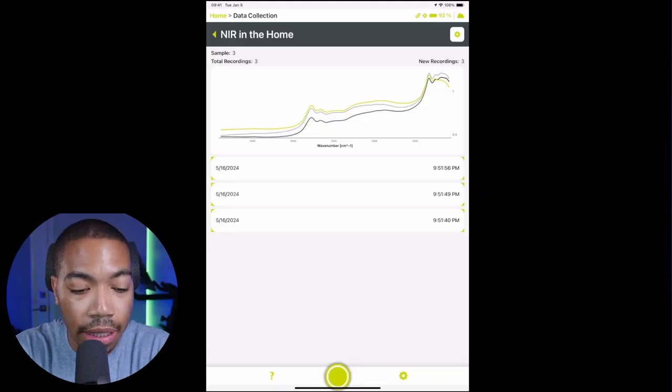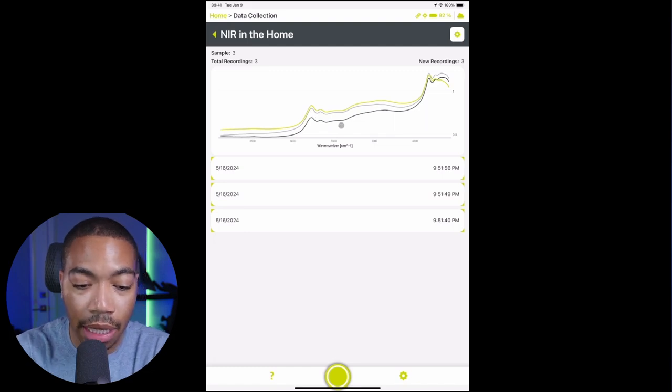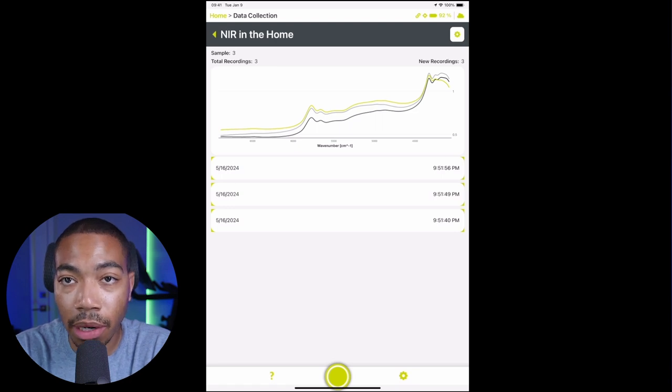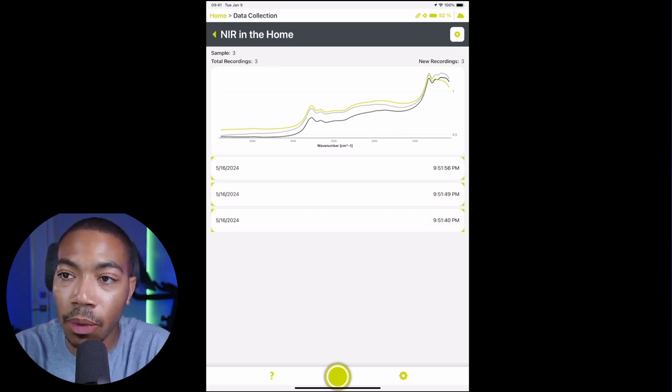So if we look at this data here, we can see that again, it does look very similar to the other HDPEs. We do see a little bit more variation between the samples, and that's probably not surprising considering it was hard to get a nice flat surface to measure on. But again, the type of variation we want to understand, and likely can be corrected with signal processing that we've discussed before. So now I'll go a little bit faster. I'll look at a lot more samples, and then we'll show you what it looks like towards the end.